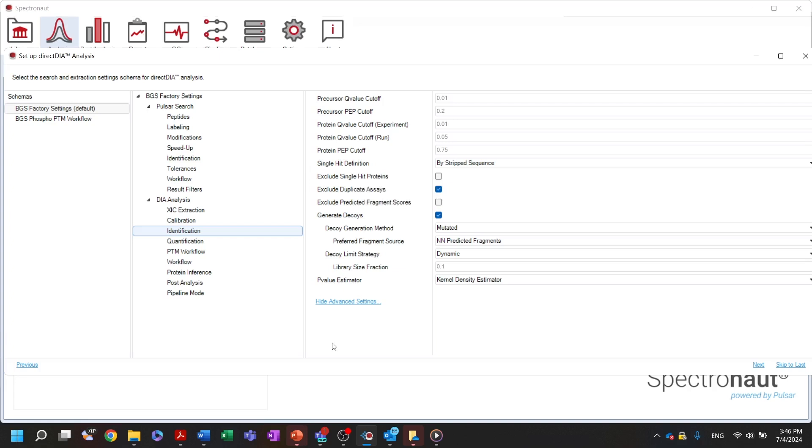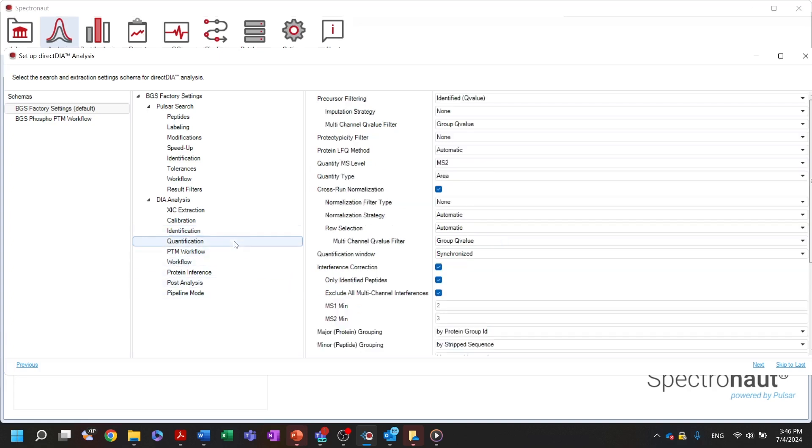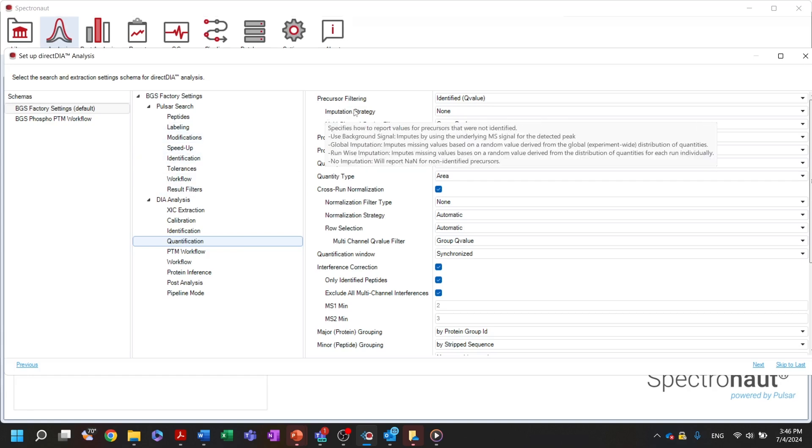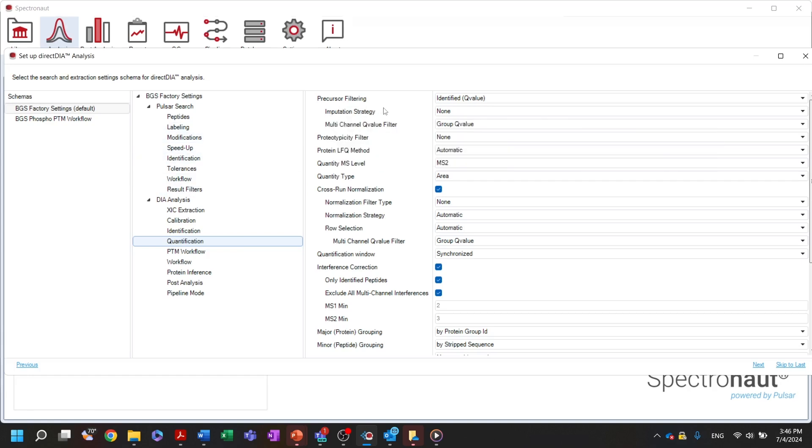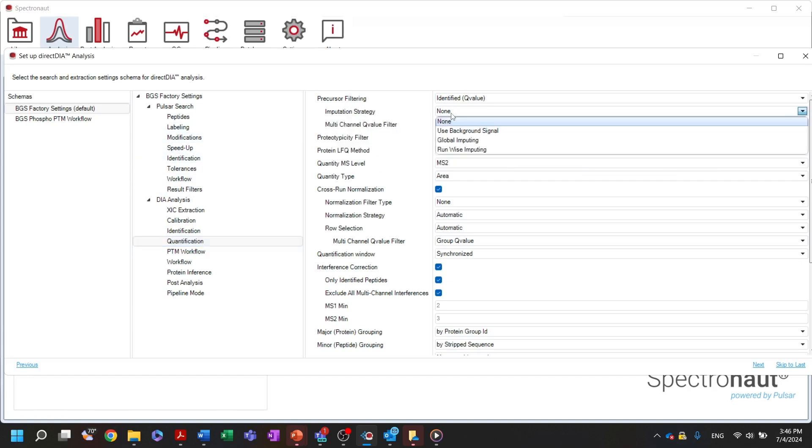In the quantification settings node, the user can specify various settings that determine which peptides will be used for protein level quantification and how this quantification will be executed. For example, here we can determine the way we will perform imputation of missing values. Note that by default, the software is not performing any imputation.